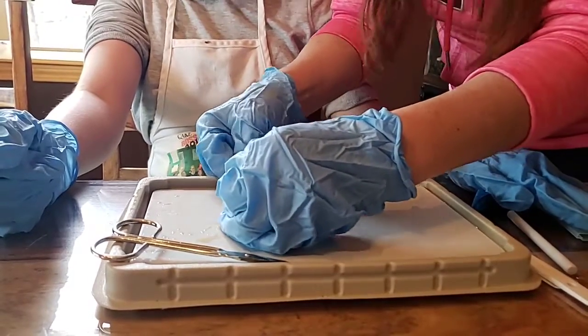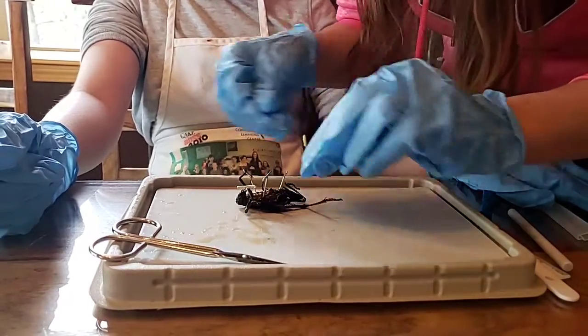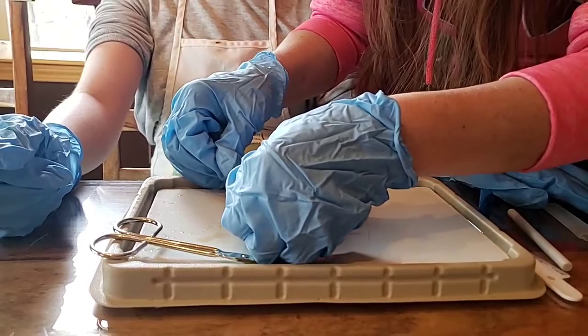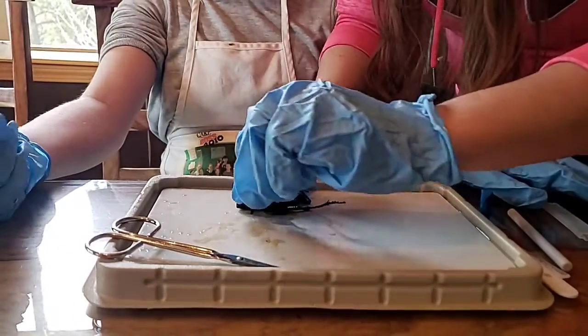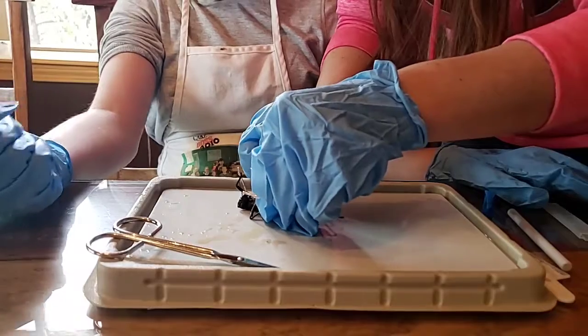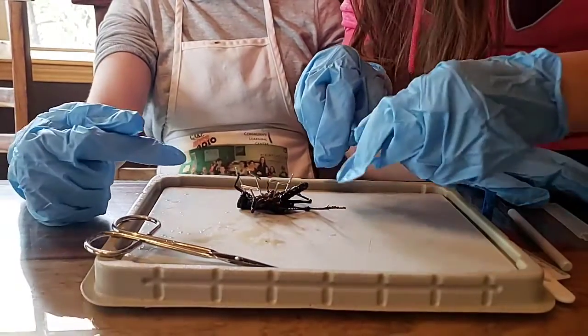Do you have another pin, Tan? Yeah, they're all over here. Okay, let's pin this little side down. This is his other carapace. Okay, pin that one down. Then we'll take this one out. Put this one down. You're going to find out here in just a second. All right, you have another pin. Okay. Look how different ours look, bud.